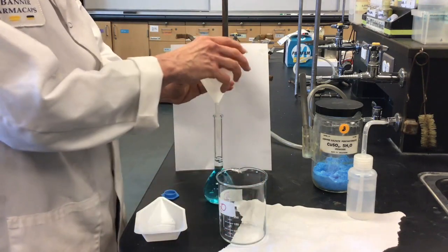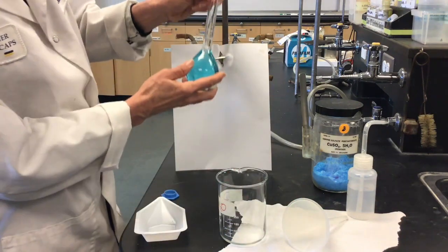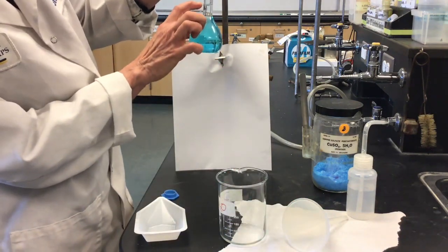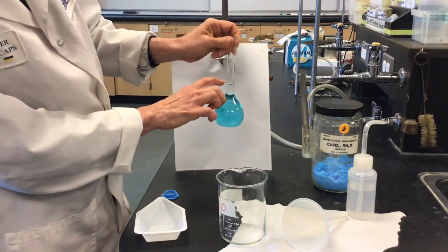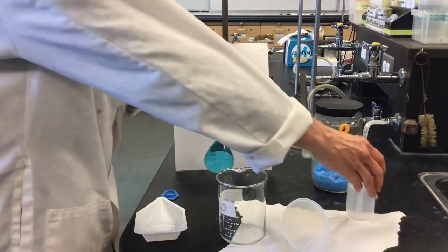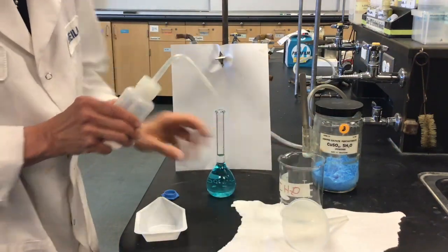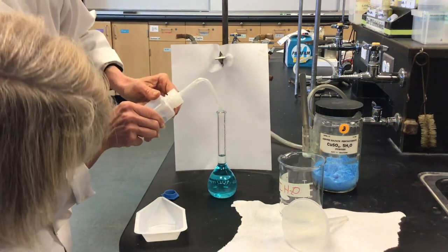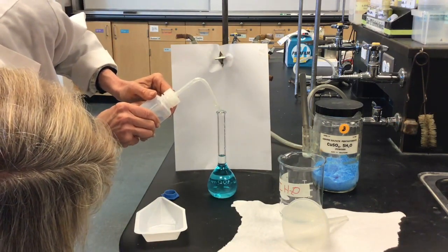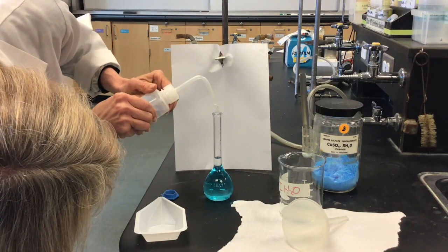So what I recommend to do, when you're getting to the point where you want to record the total volume, is we have an etching on our glassware. It's right here, and the bottom of the meniscus needs to touch the top of that line. So to be a little bit more controlled, I'll use a water bottle and I'll go in drop by drop, and again I want to be checking this at eye level so that I get exactly my 100 mLs in there.